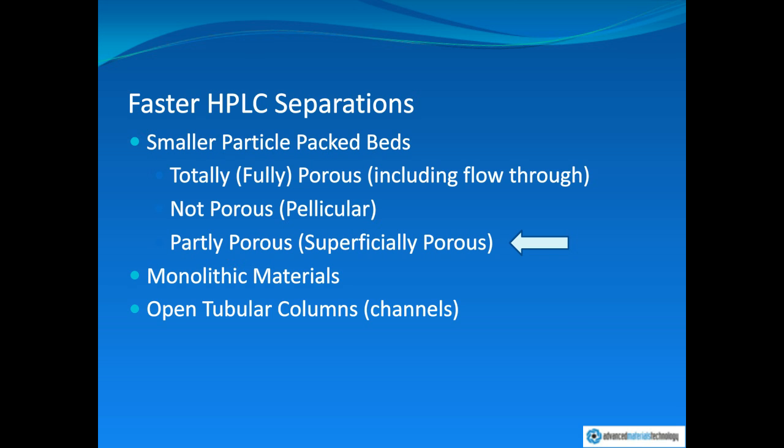There's non-porous particles, also in older literature referred to as pellicular particles, and these are solid bodies which are generally spherical in shape. Or there's really what concerns us the most today, partly porous or superficially porous particles. And this is a technology that we have worked very hard on, stretching back over actually almost 30 years now. That'll be really the focus of today's discussion.